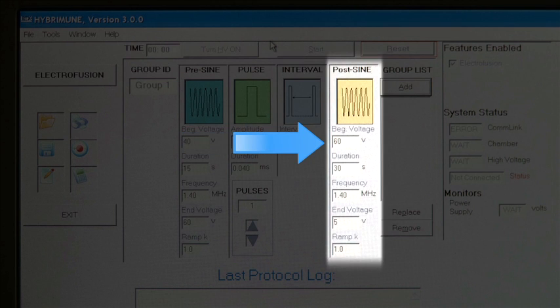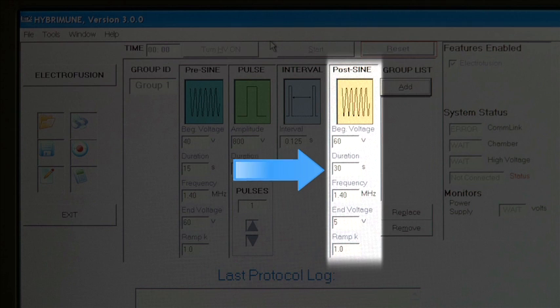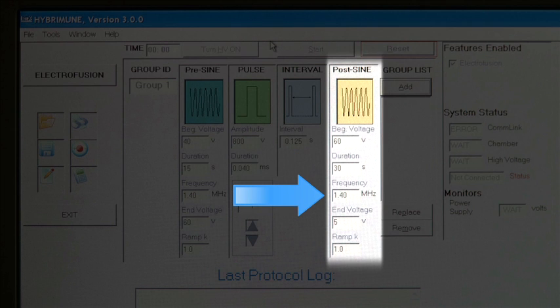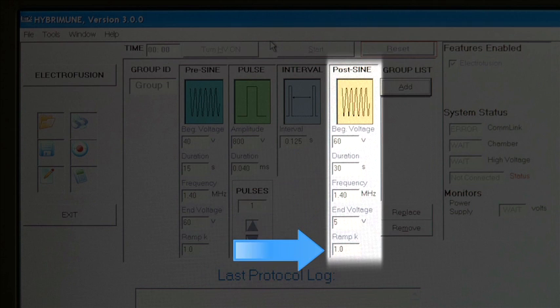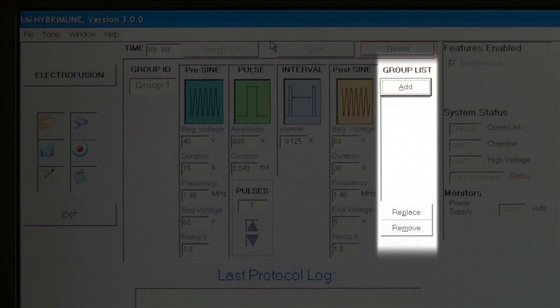Post-sign parameters include: beginning voltage, duration in seconds, frequency in megahertz, end voltage, Ramp K, and non-linear ramp constant. The Group List displays the list of groups in the current protocol, and the groups will be executed in the order displayed.